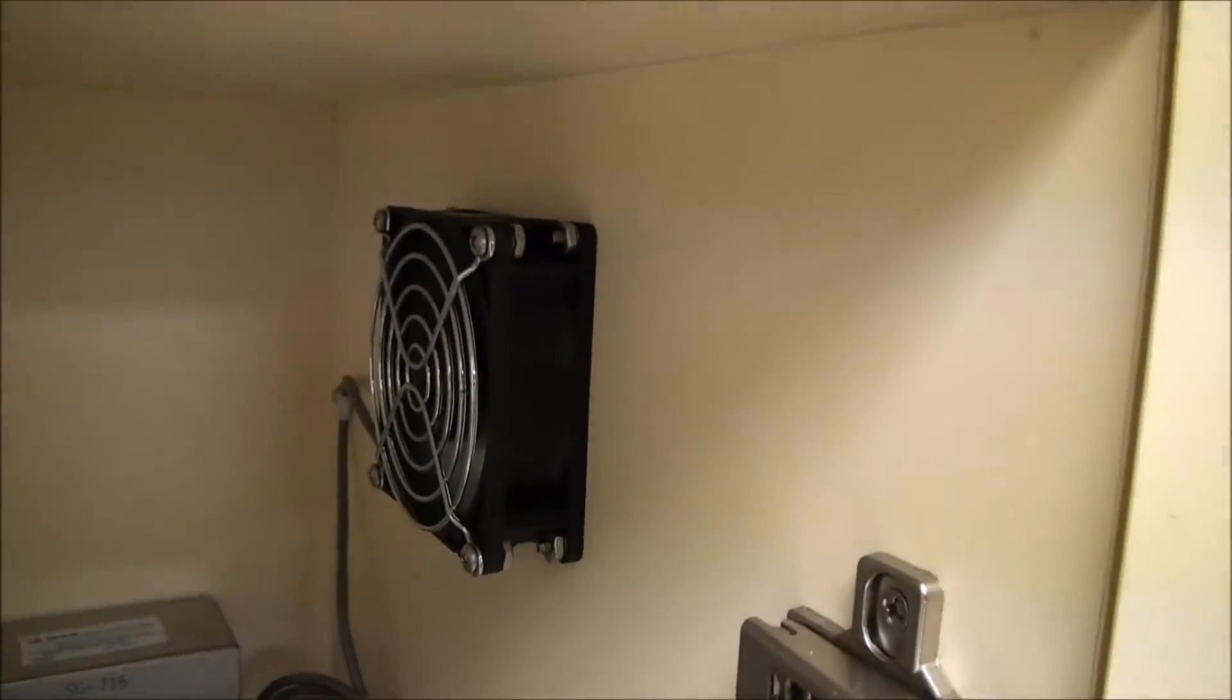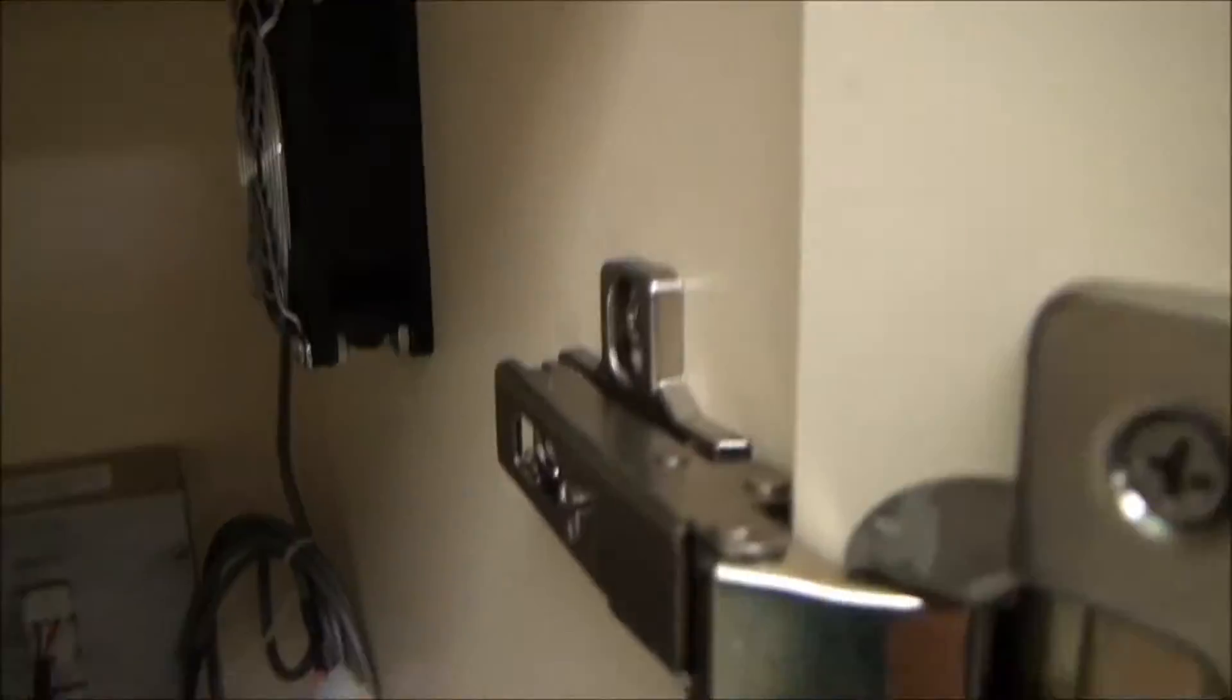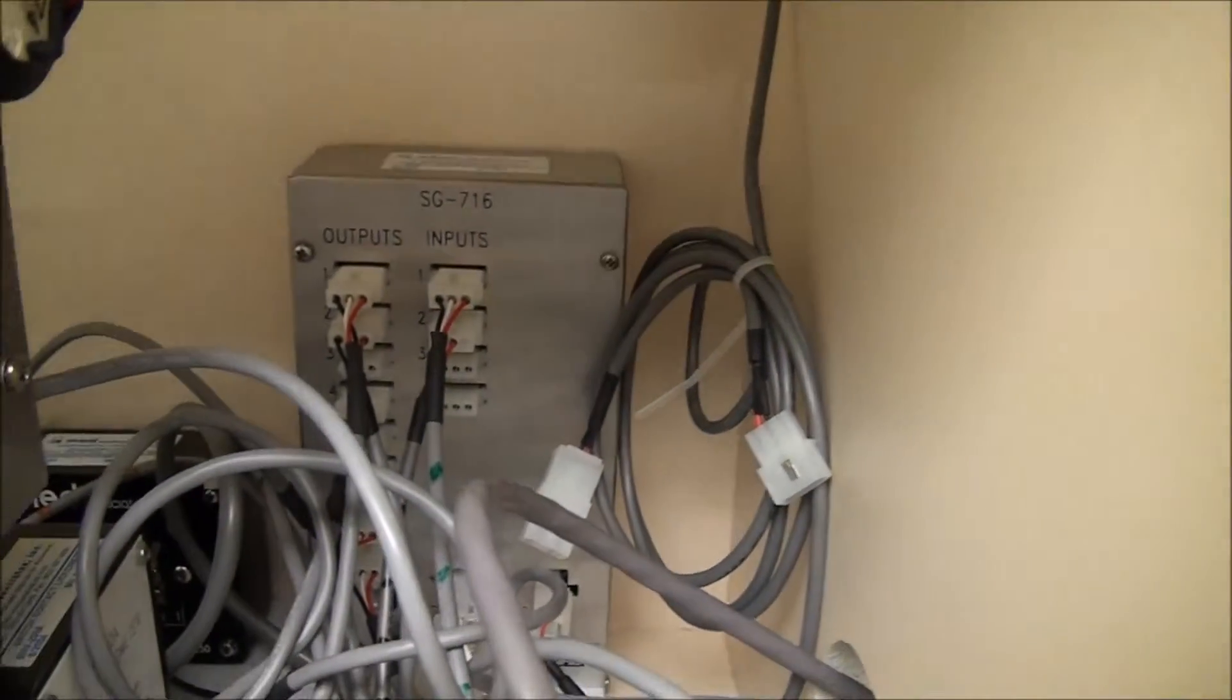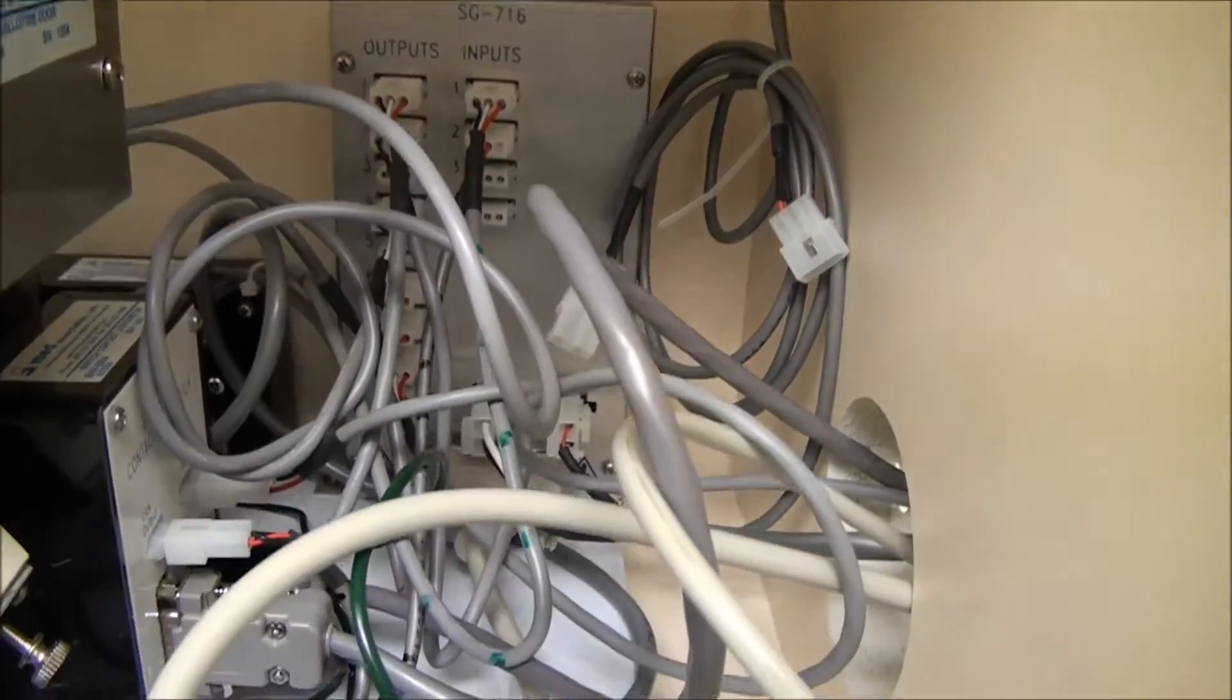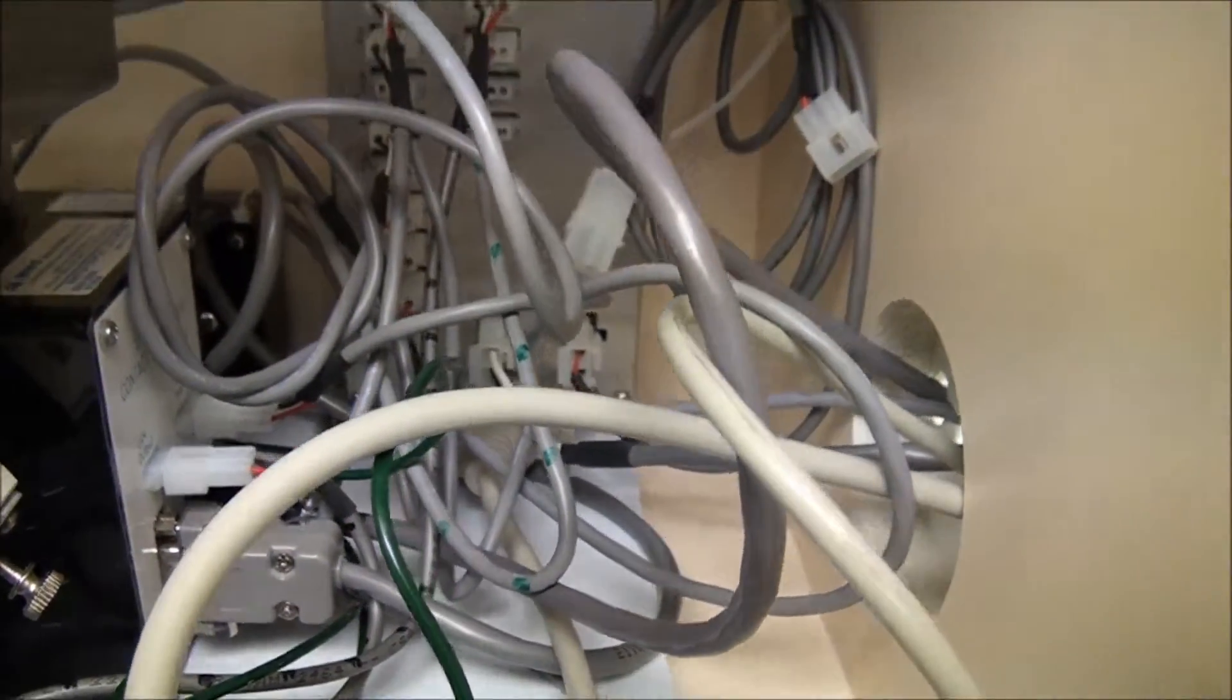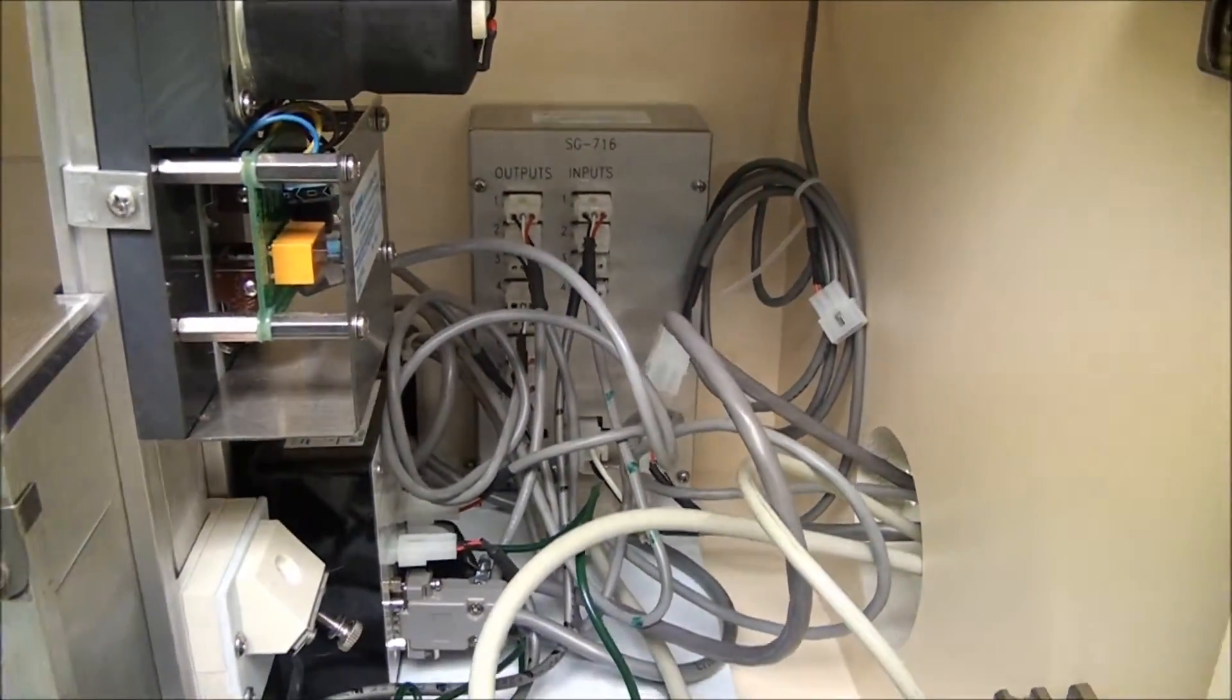Of course, you can hear the fans operating in the background. And we have more room for more inputs and outputs right now. There's only five, and you can put up to eight on the output. So it is definitely expandable.